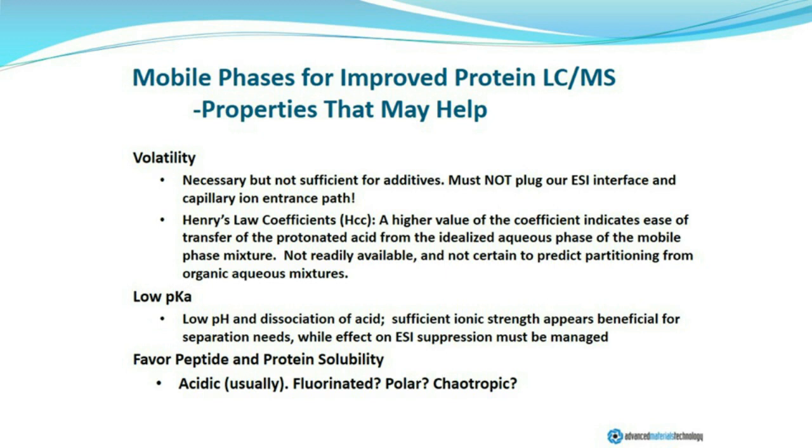Now there's an additional set of criteria here, which is we're going to use this for protein and peptide analysis, and in order to be useful for protein and peptide analysis, we want those components that will favor solubility.